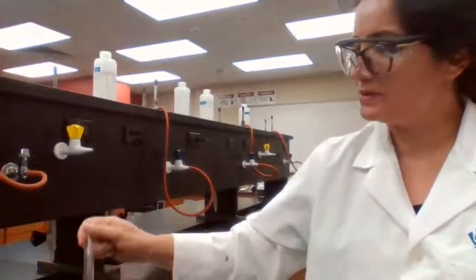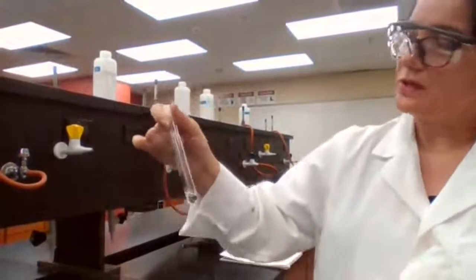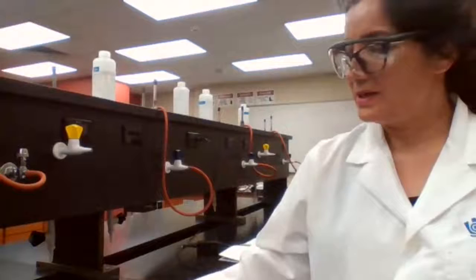I was just nervous because it didn't happen right away. But after I left it for a while and I went a couple of times looking for solid ammonium chloride to make the solution again, good news was that it did form the crystals and it worked.